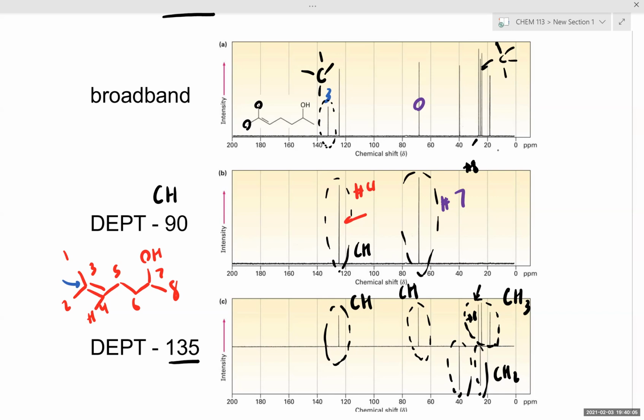Why is the signal disappearing? 1, 2, 3, 4, 5, 6, 7. Isn't the third signal up there that you originally assigned as a tetrasubstituted carbon, isn't that the negative CH2 in the DEPT 135? Oh, yeah, that makes a lot more sense. Okay, perfect. Sorry, when I wrote out and included the circle around it, somehow it completely covered it up. Okay, that makes a lot more sense. I was wondering where that second tetrasubstituted carbon was.